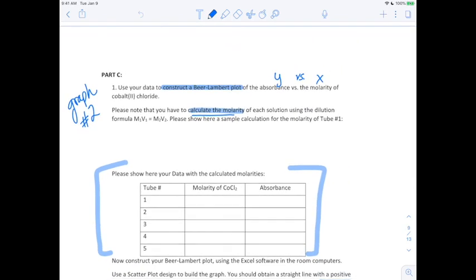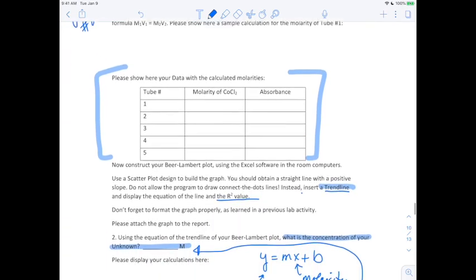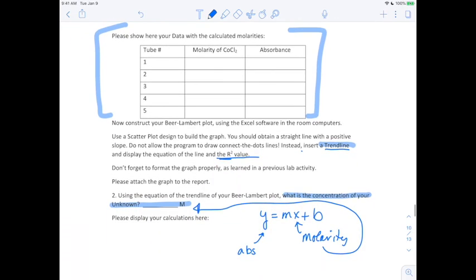So we've already talked about graph number 2. Number 1 is just graph number 2. And we've talked about how to fill out this table. I don't know if I got a chance to talk about that R-squared value. The R-squared value tells you how well your data fit the line. Our data fit the line pretty well, but if it was your experimental data, this is a way to check to see if you did a good job with your data.